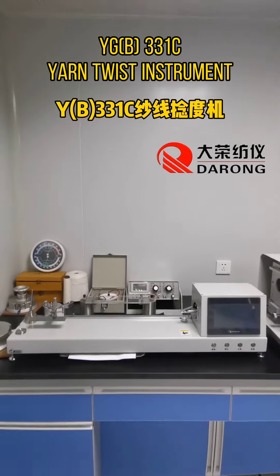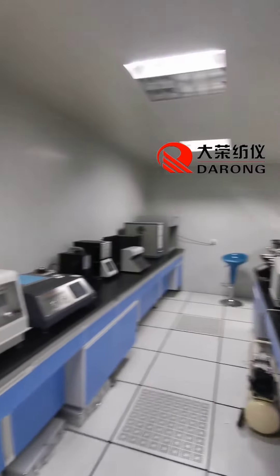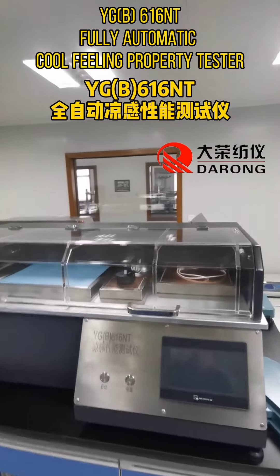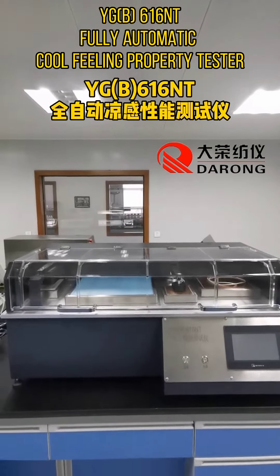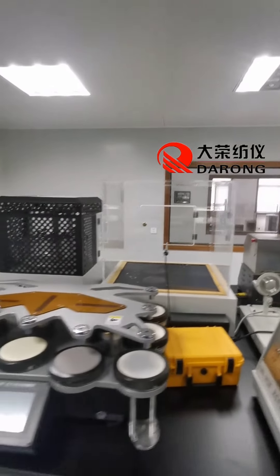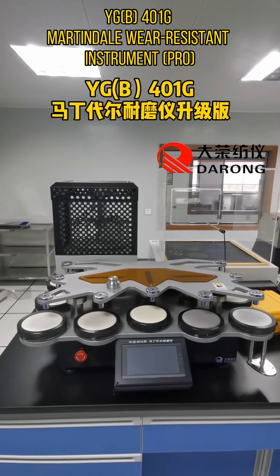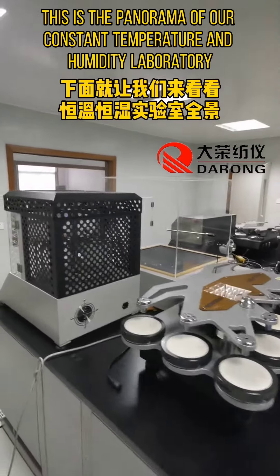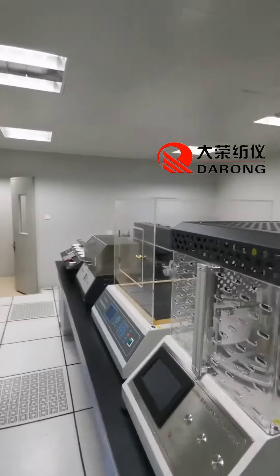YG(B)331C yarn twist instrument, YG(B)616NT fully automatic cool feeling property tester, YG(B)401G Martindale wear-resistant instrument pro. This is the panorama of our constant temperature and humidity laboratory.